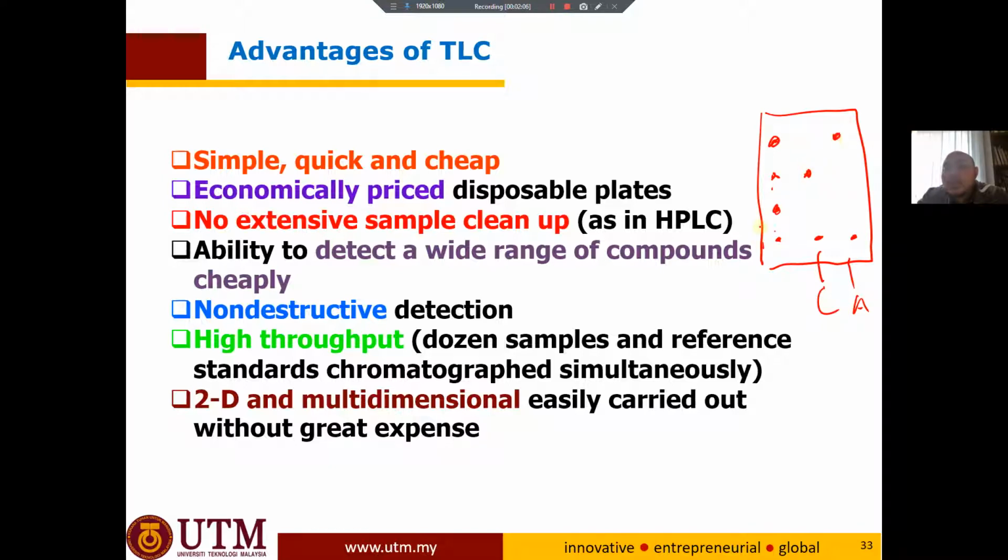So what you can do, like I said before, the TLC is only used for screening. From the TLC plate you can scratch this spot, and then dissolve it in solvent, and then you can run it on the HPLC or GC. So in Jabatan Kimia Malaysia, in court, the analysis needs to be done at least twice, by a screening and also a confirmatory technique.